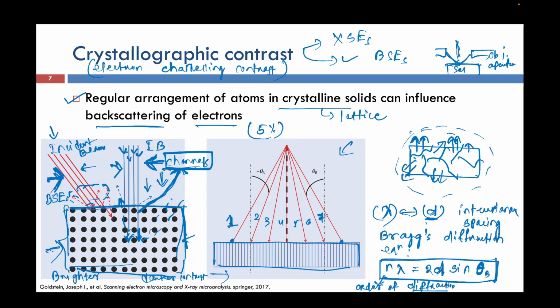When the Bragg's diffraction equation matches with the Bragg's angle, then the diffraction will happen.